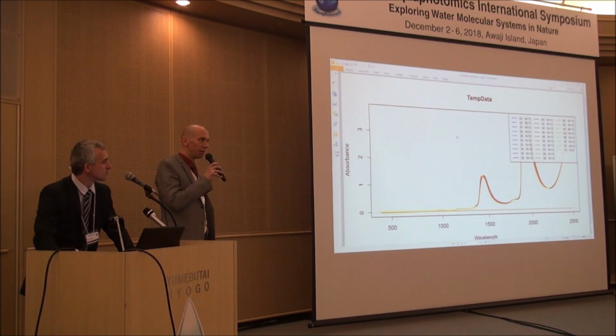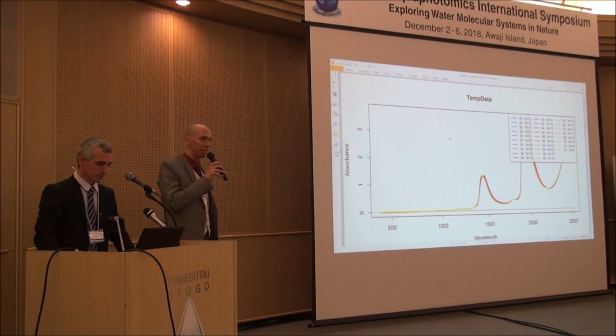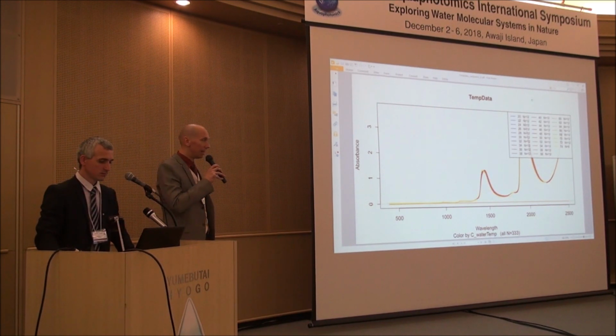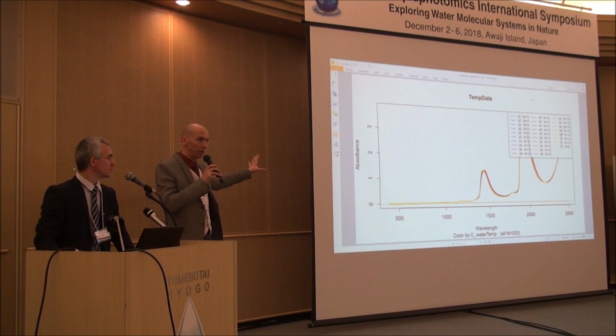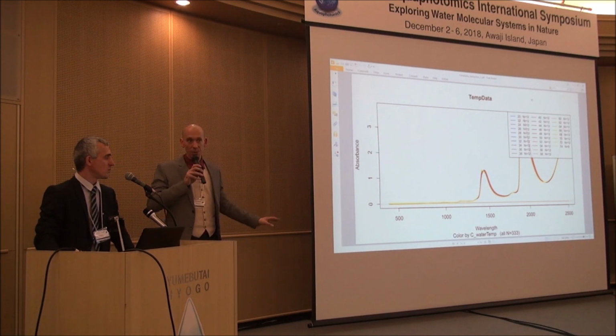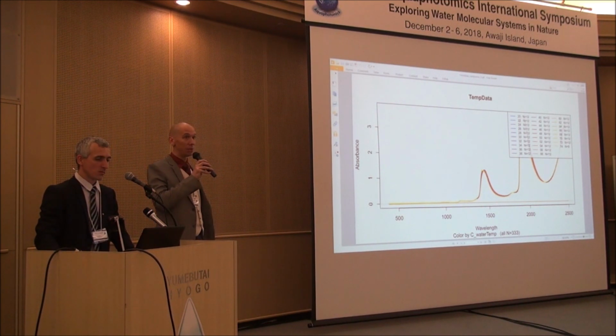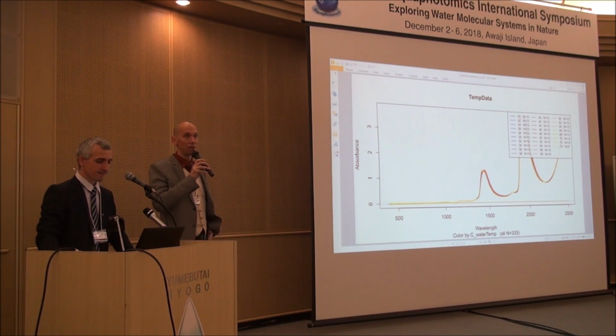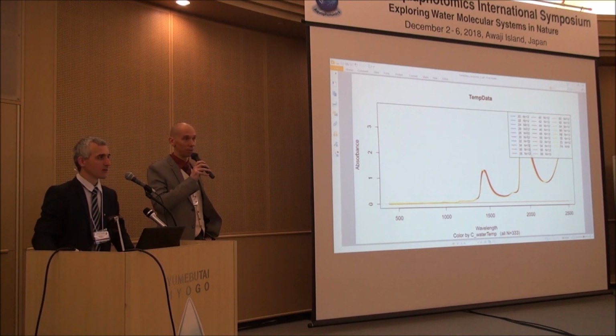You might feel confused that you see, oh, I'm doing things and I don't even understand what I'm exactly doing. For those who really want to use it, every function that we lined out in the routine number 2 is, I hope, in great detail described in the help, in the manual of the package. So if you want to know all the options like TTL equals F, what does it mean? We don't have the time to explain all of this now. You will find this out all in the manual of Aquap2 in our program.